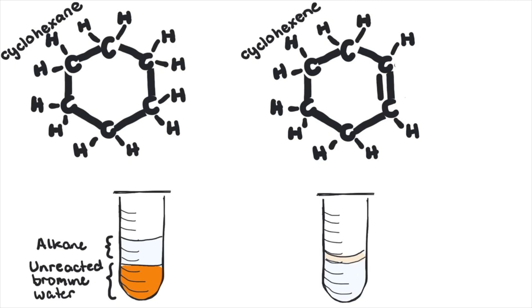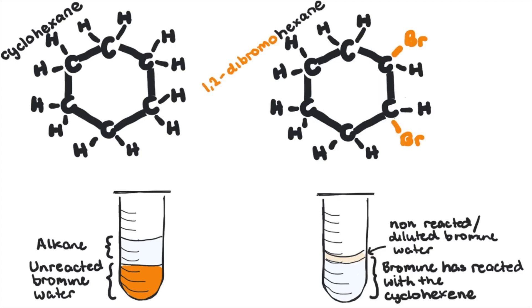In the cyclohexene example, the unsaturated hydrocarbon, the orange hue of the bromine water has faded to clear as each bromine atom has attached itself across the double bond. After all, it is the bromine responsible for the colour.